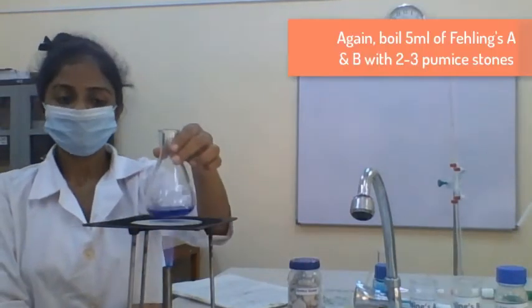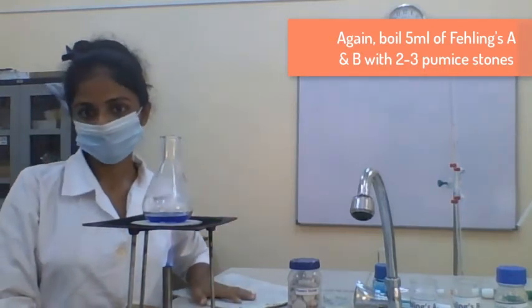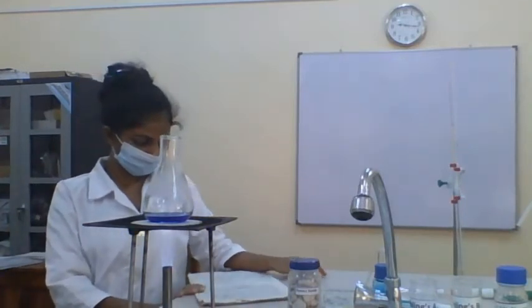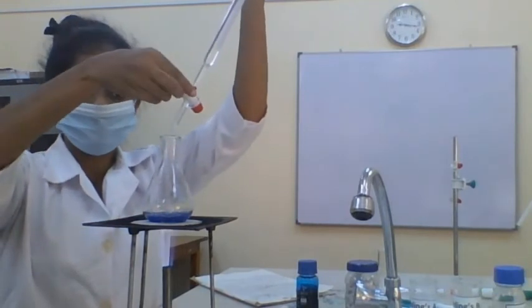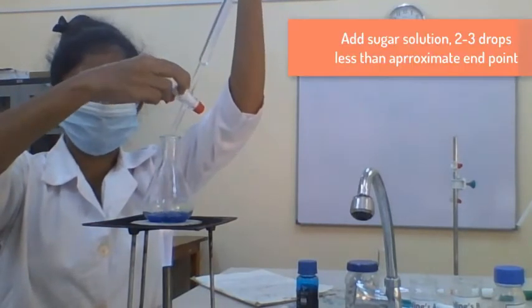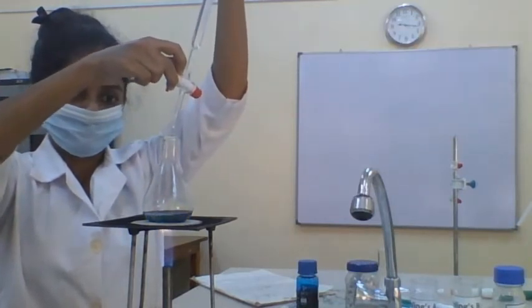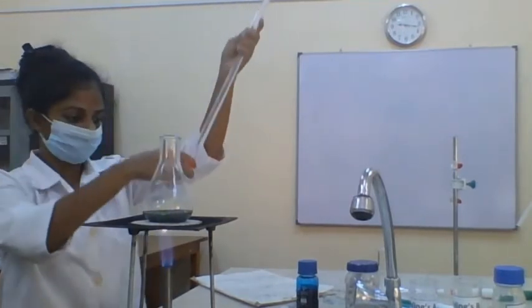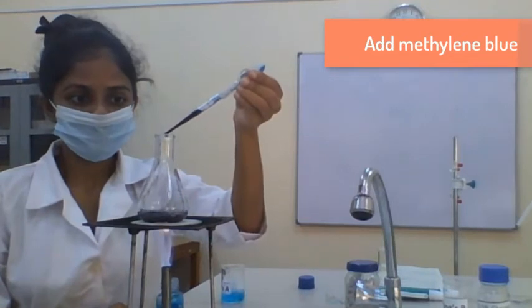Then we have to repeat the previous procedure to get another reading. Then you have to add sugar solution into this solution. Then add methylene blue into the solution.